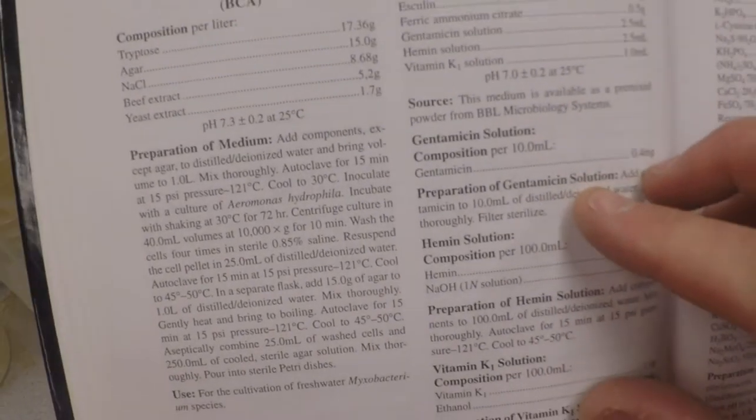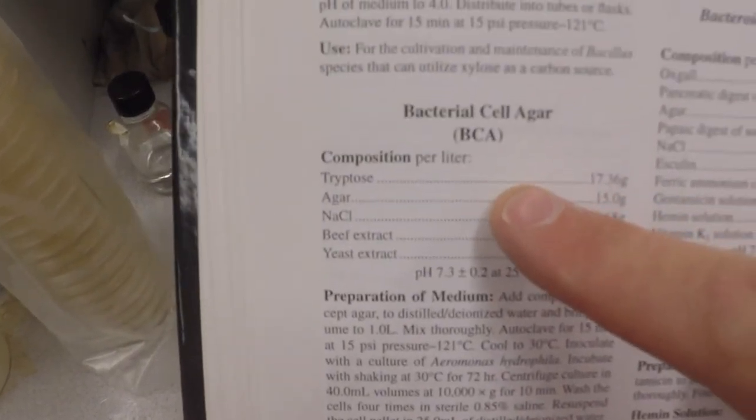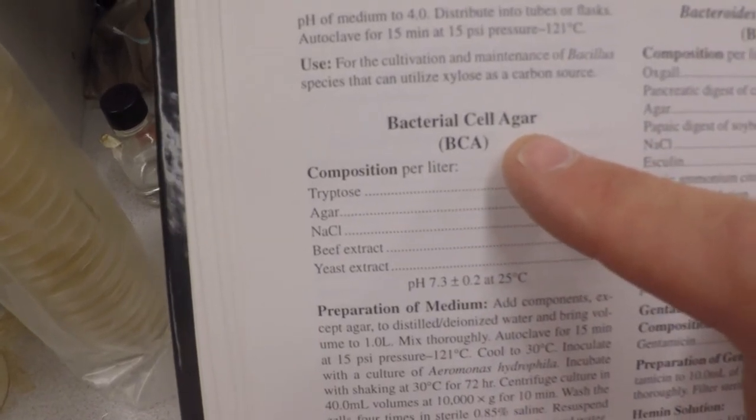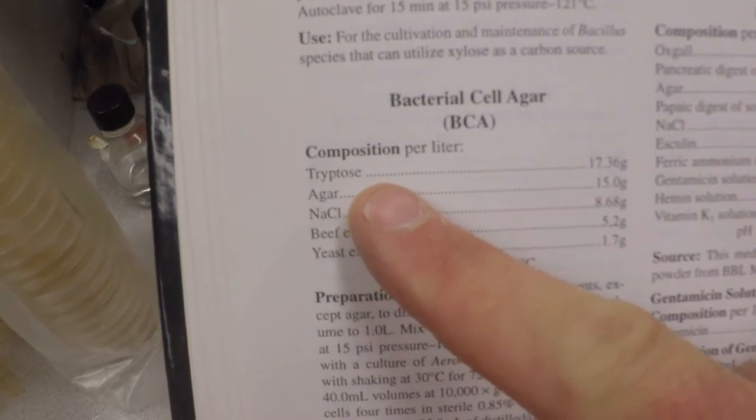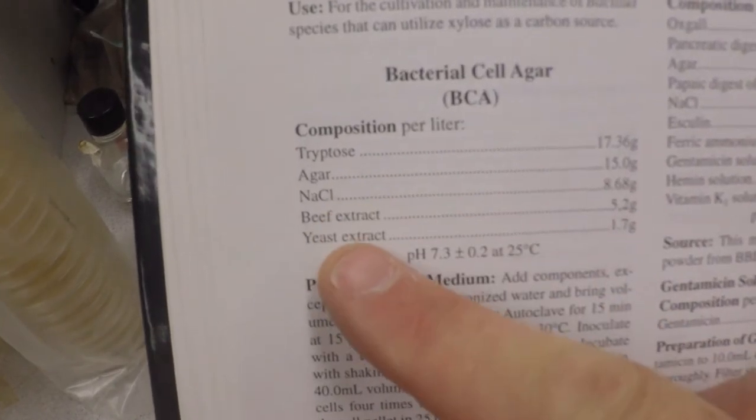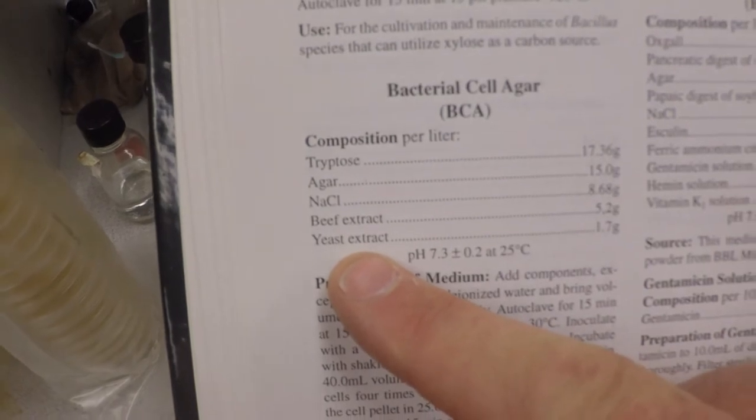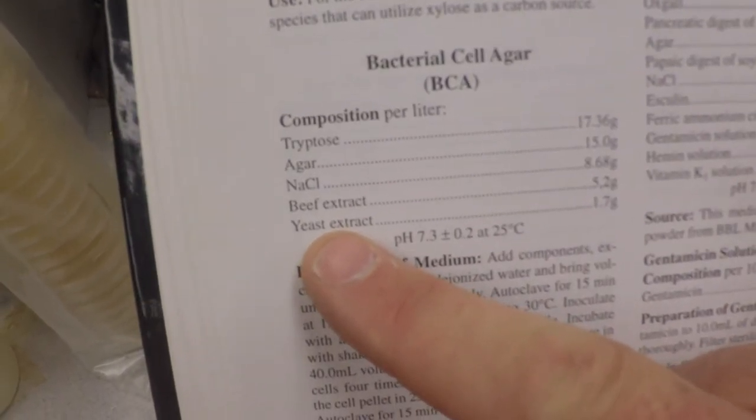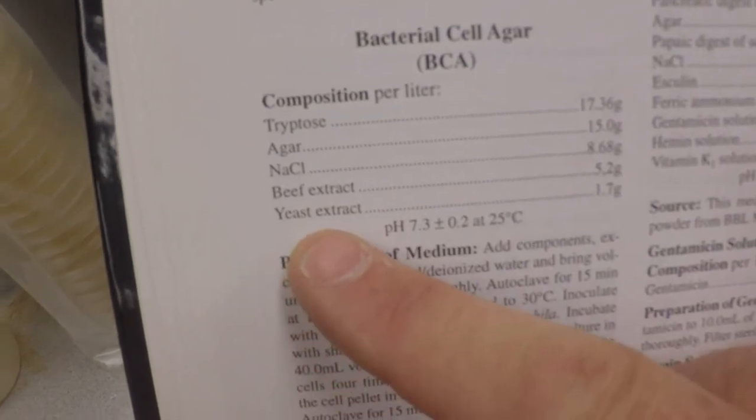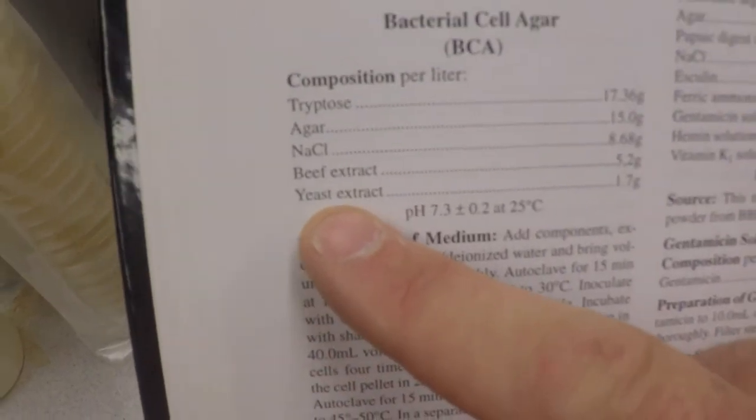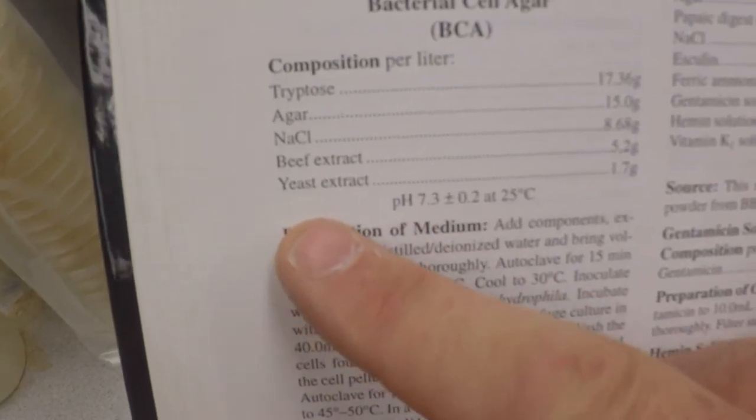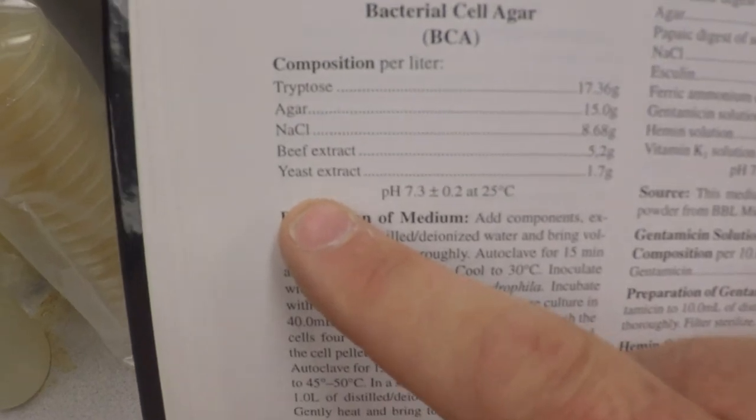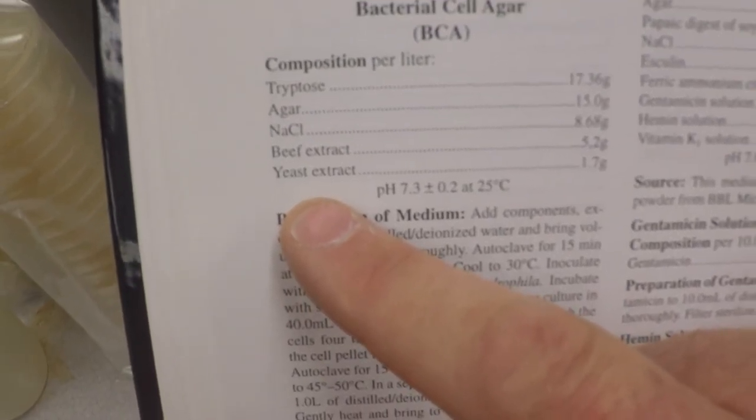This stuff here is called bacterial cell agar. You look at what the composition is: it says tryptose, sodium chloride, beef extract, and yeast extract. What that means is literally yeast extract is like the stuff you buy at the store—bits and pieces of proteolytic digestive yeast, same with the beef extract. You don't know what the heck is in those. There's different concentrations of all kinds of things in there. That's why this is called a complex medium.